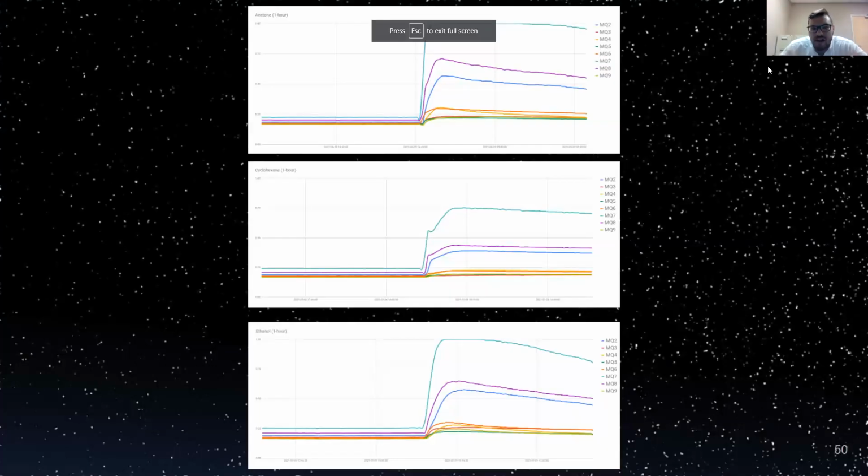Sure, that'll work. So yes, there is a bit of saturation on these. You can see it on ethanol and acetone both. Acetone typically would reach the top of this graph. I attempted to mitigate this by going down as small as I could with the drops. There is a point, at 0.05 milliliters of each chemical, where it's more difficult to mitigate that with the instruments that were used. But this does reach saturation for a moment. You can see acetone and ethanol both reached a value of 1 and stayed there for a minute or two, approximately.